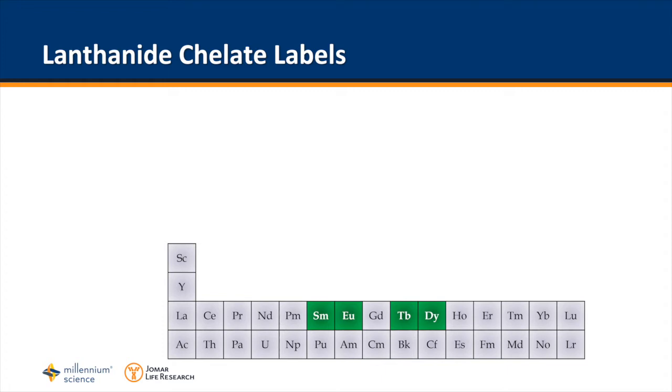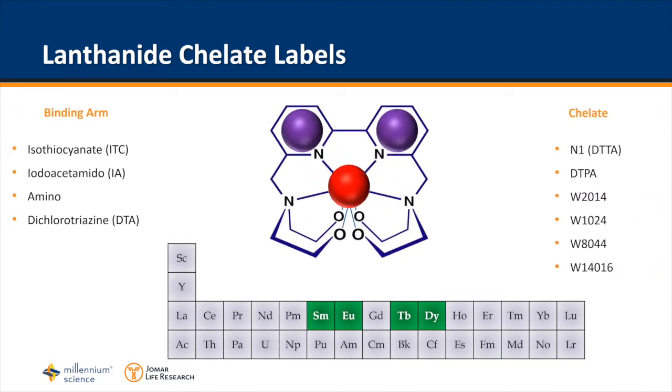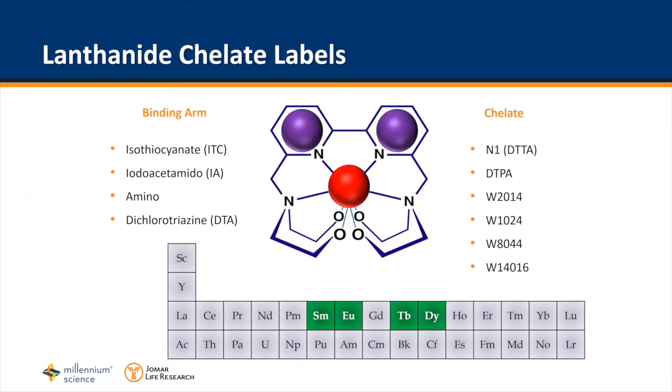Kinetic fluorescence is usually reading a normal fluorophore such as rhodamine, Texas red, FITC kinetically, reading the same well over and over again over time. TRF utilises lanthanides within the periodic table, on which there are only 4 that you can use to run TRF chemistry. And these lanthanides exist in a cage, and the purpose of this cage structure is to protect the ion and use it as a transporting mechanism throughout the assay.